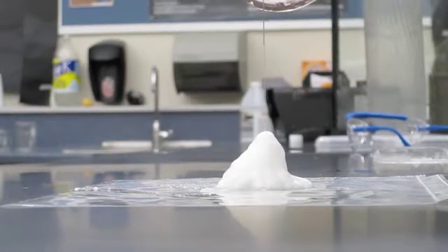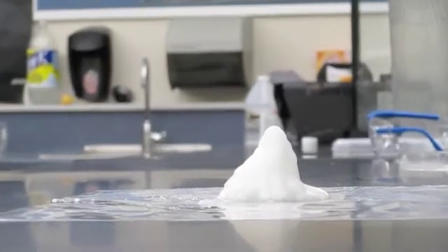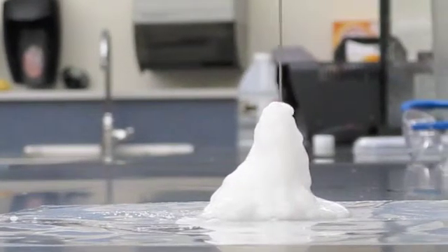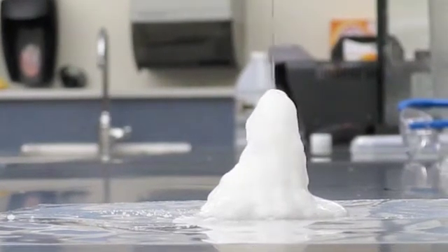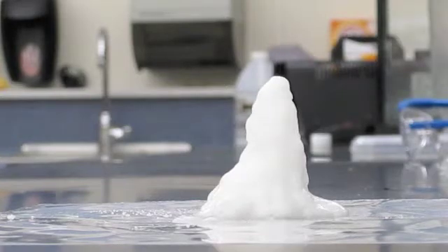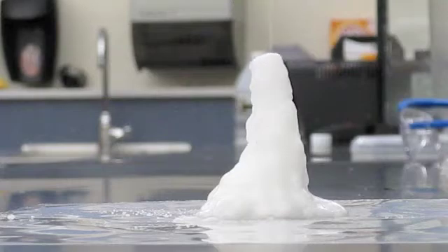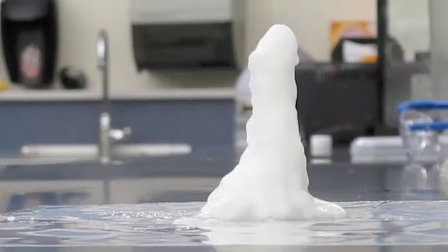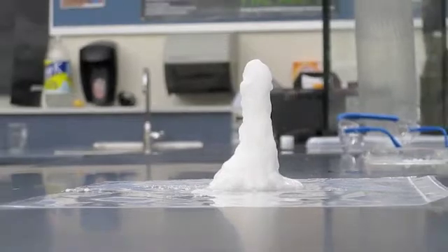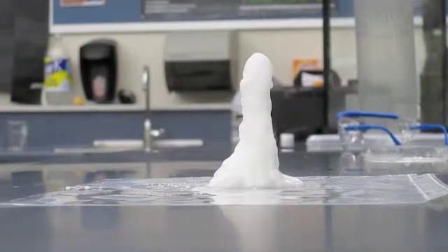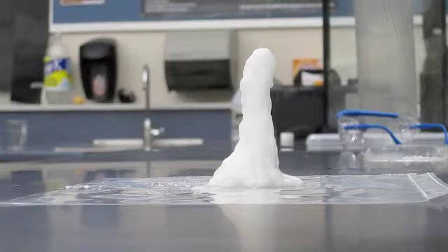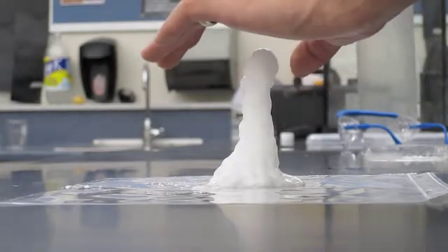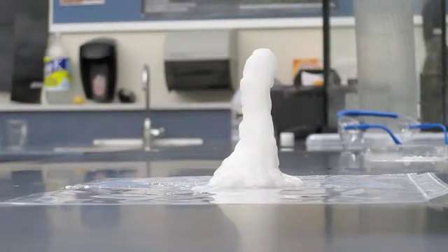So you can start to see I'm kind of building up a column. Pretty awesome stuff. This might be one of the best batches we've had. So we can start to build up this super cool. Now what's interesting about this is it looks cold, doesn't it? We call it hot ice, because this is an exothermic reaction. And what's happening is it's actually releasing heat. If I hold my hand over this, it feels warm, not cold. Pretty cool.